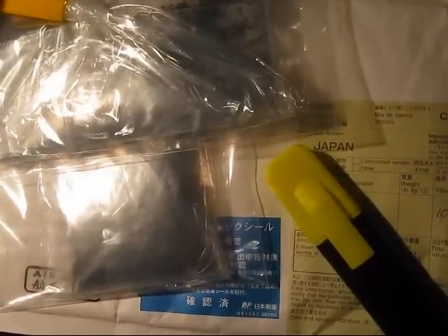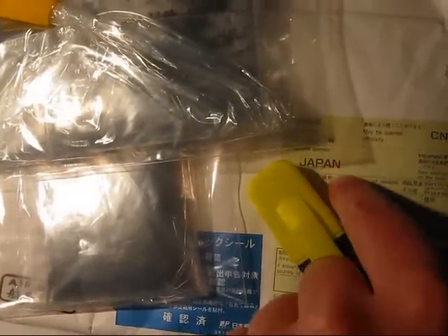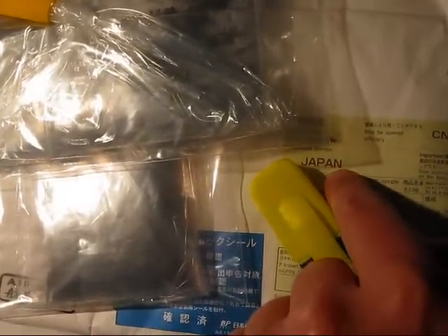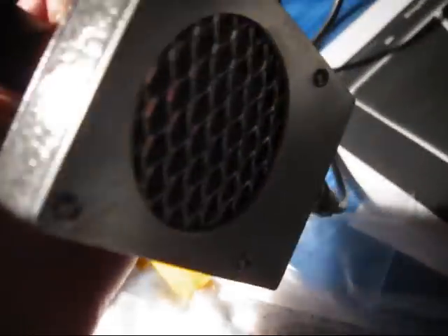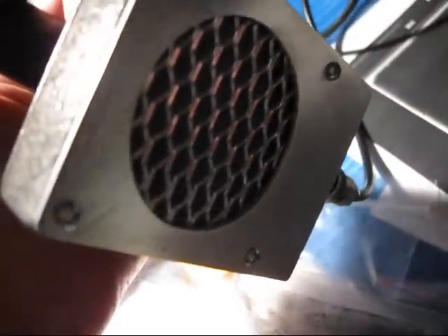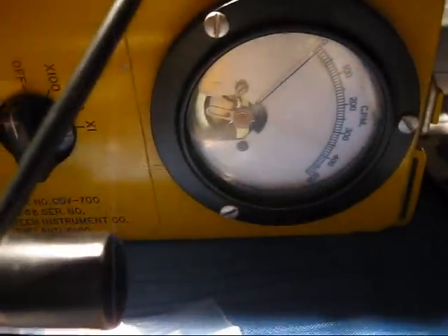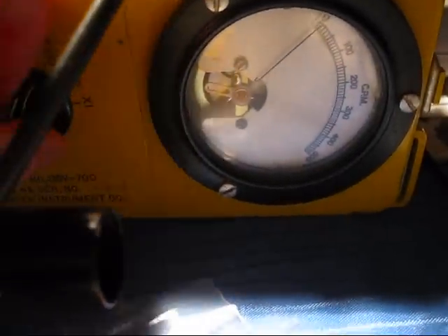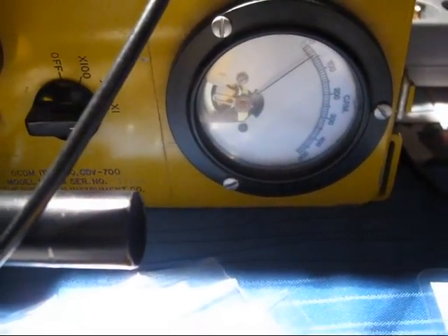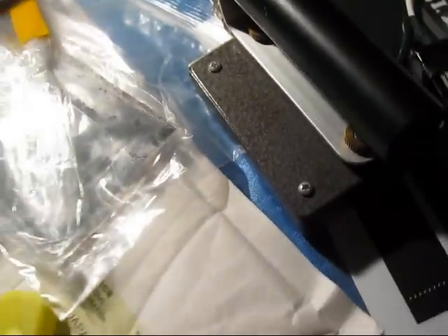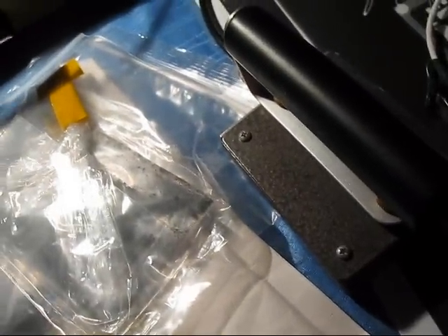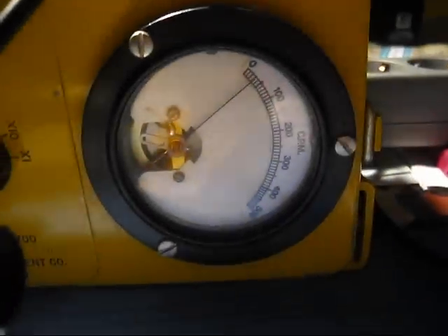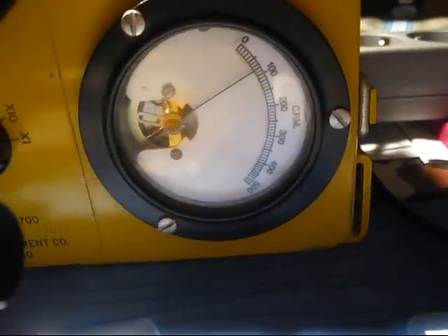I have just received something quite interesting from Japan. These are soil samples, and here I've got my little pancake Geiger-Muller counter and the good old CDV-700, which I'll put on now on the x1 scale. For now, I'm just putting the pancake right next to these unknown soil samples.